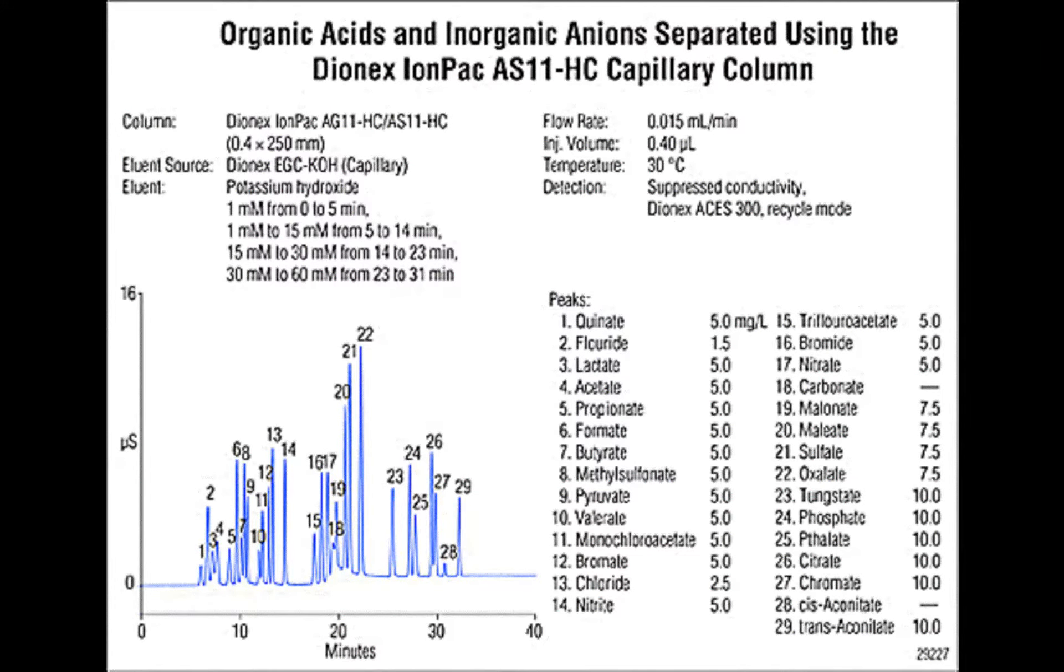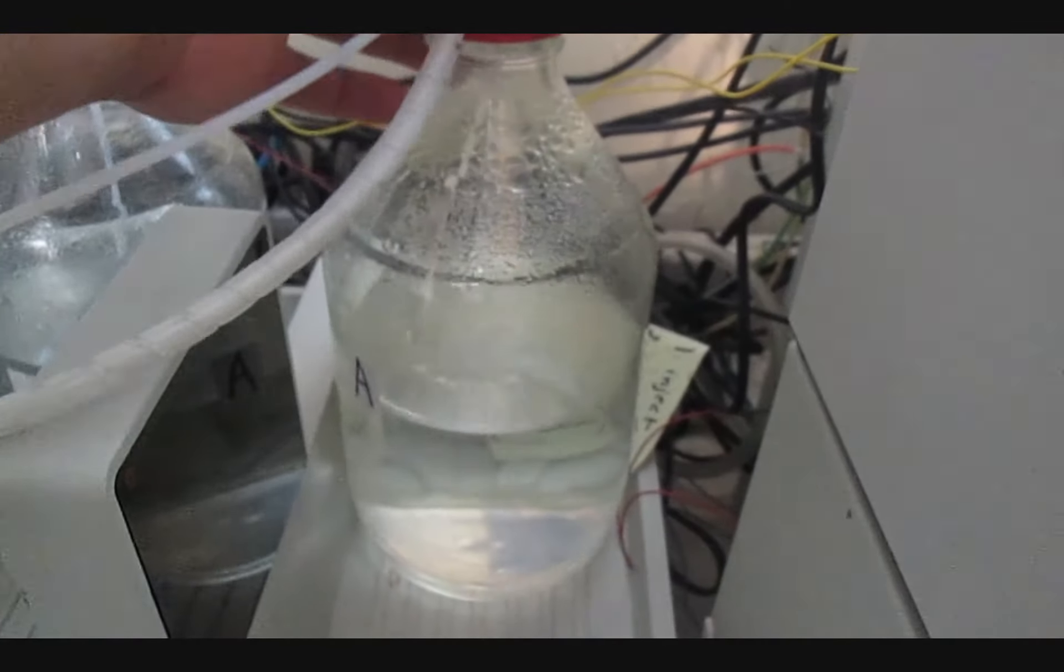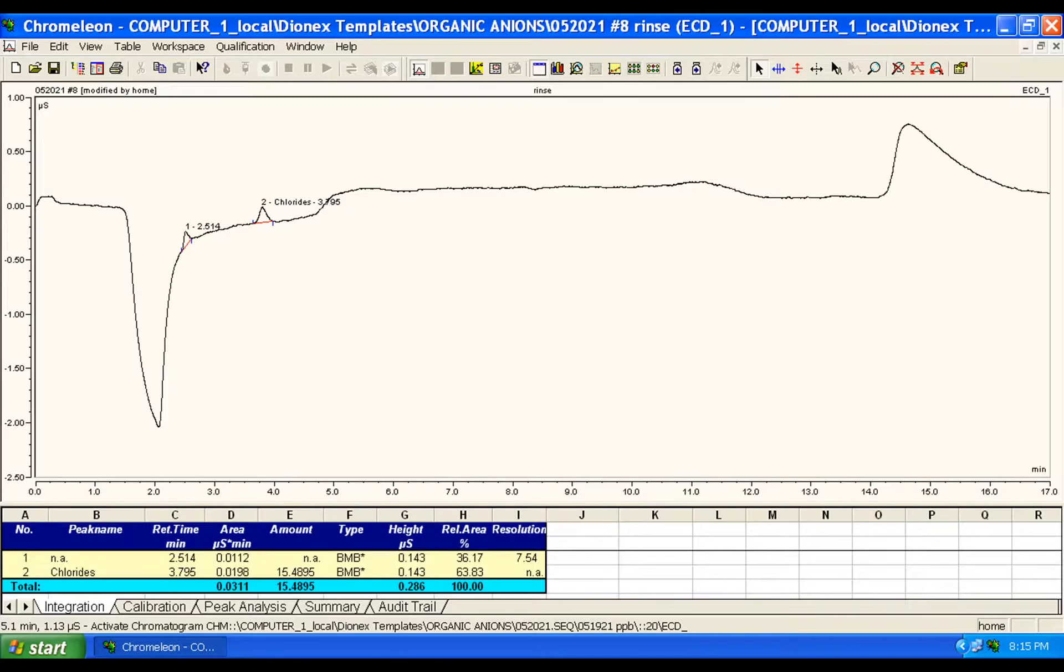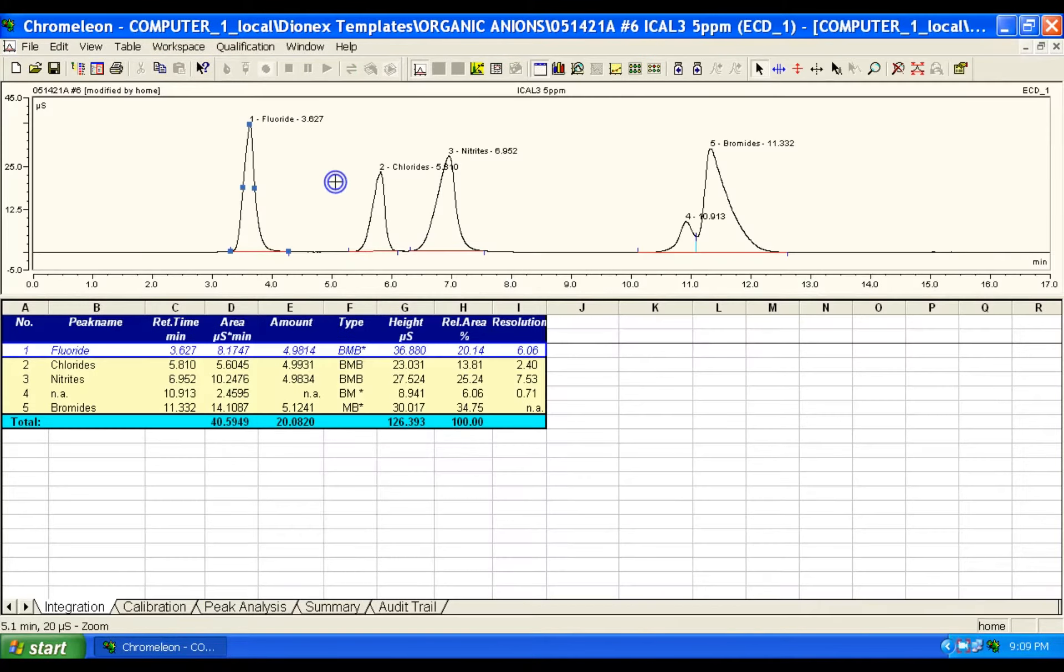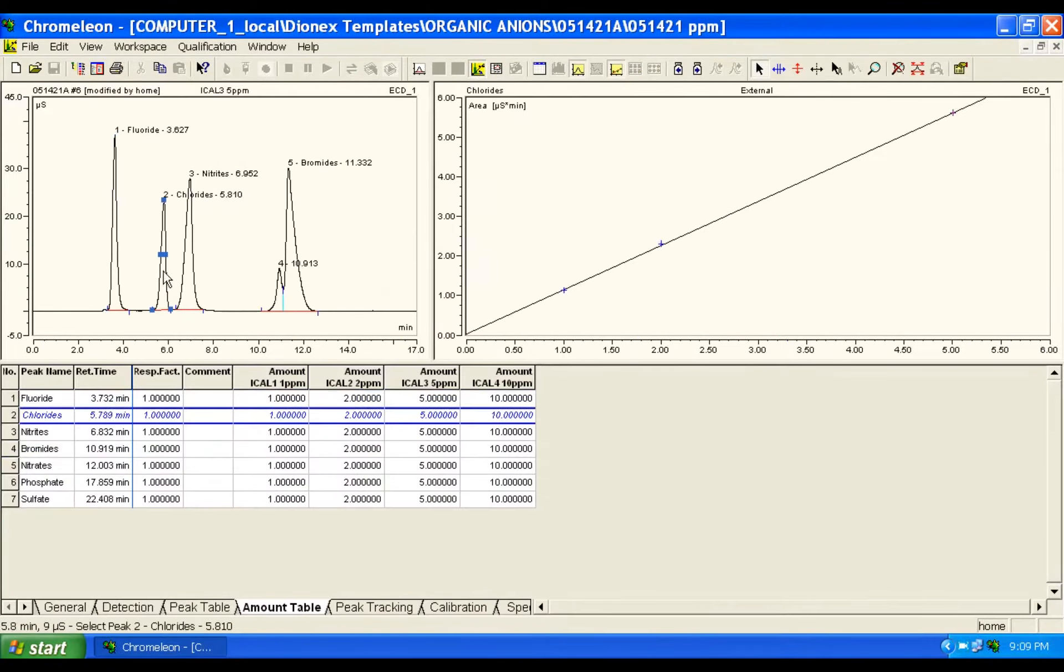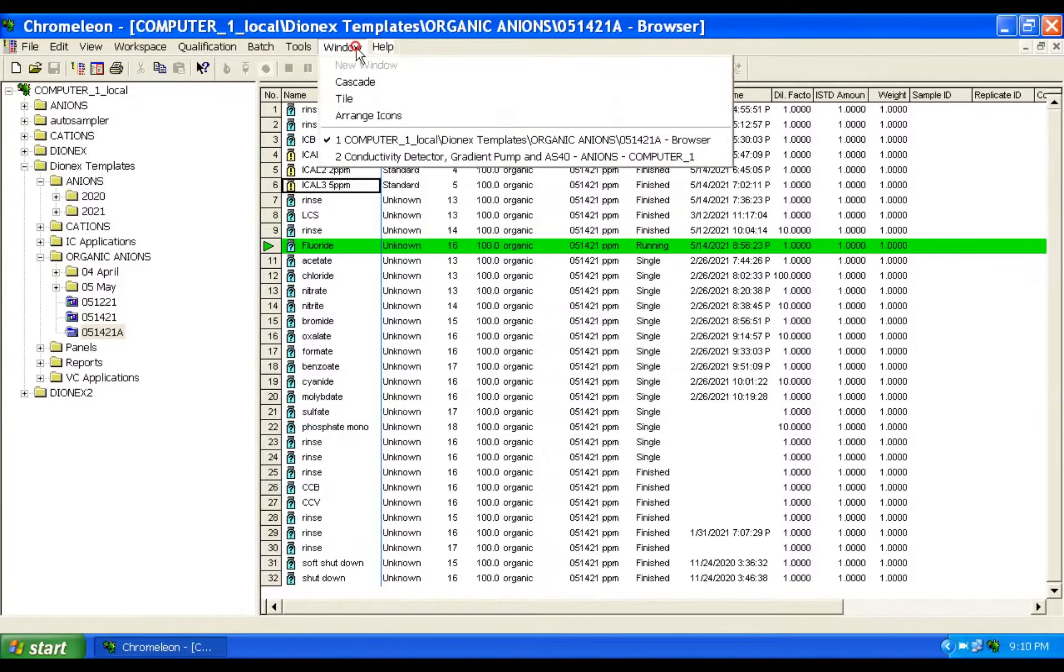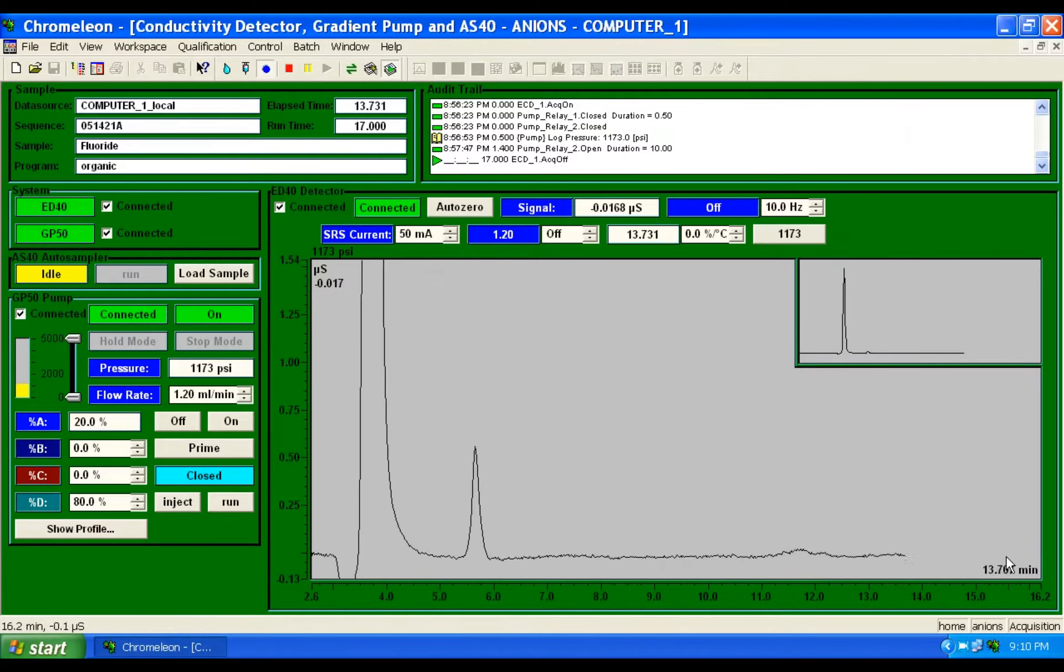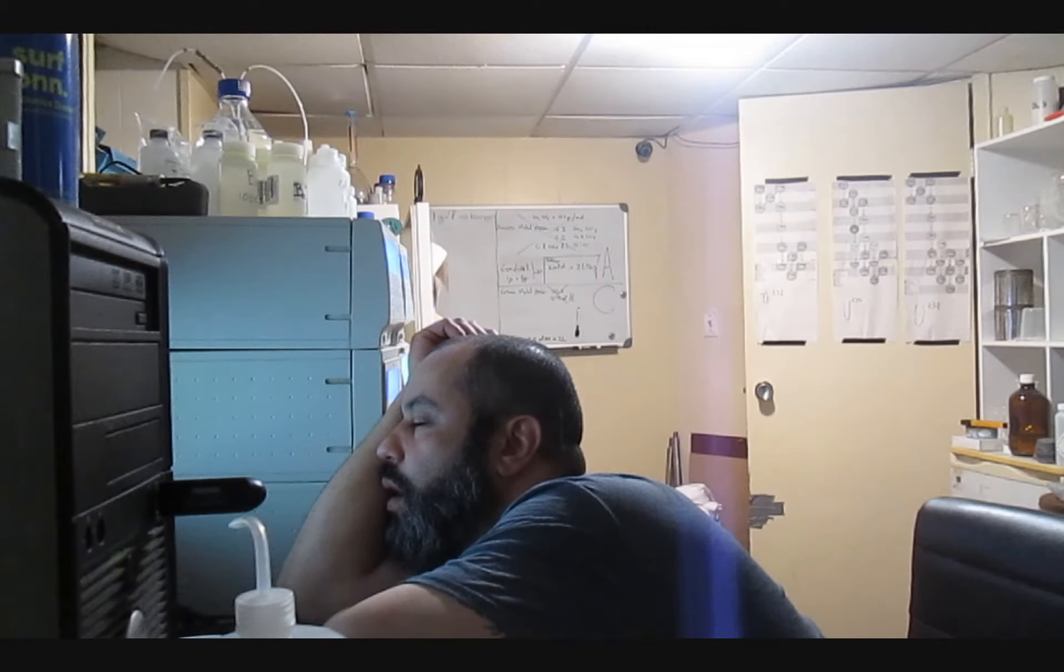So I found this AS11 designed for that purpose. But as you will see, I'm not sure the trade-off was beneficial. To use this column, I have to change the mobile phase from carbonates to hydroxide, which is why you will see a hump for the carbonates in almost every low-level chromatogram, since the carbonates are no longer part of the eluents. After a thorough flush, I had to re-identify all the peaks and retention time and recalibrate, which is a long, tedious, time-consuming, and boring process.